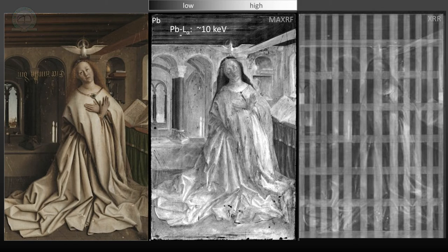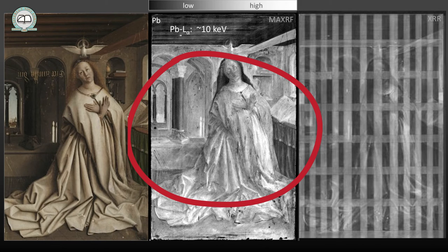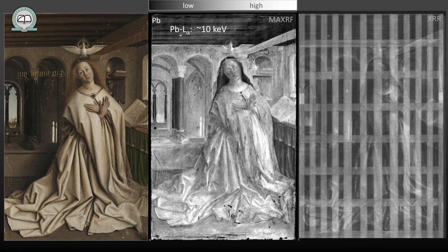So normally, when you use the traditional way of X-ray radiography, you shoot X-rays through, you see this kind of lattice work. It looks a bit like the Virgin Mary is behind bars. That's because it's very thin wood, and there is a lattice work behind to strengthen it, to keep it flat. It's a standard procedure. And with X-ray radiography, you see that, but you don't really see the details. But if we scan this with our method, we really see the details very well. And you see some changes here. You see all kinds of damages, actually, which were repaired, and parts where there is no longer paint.